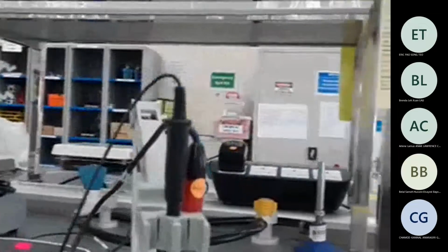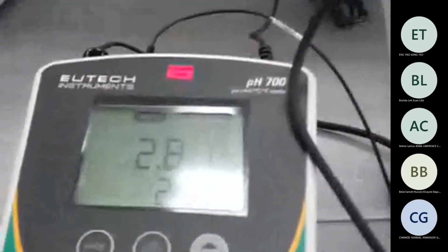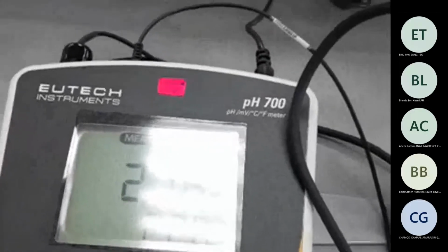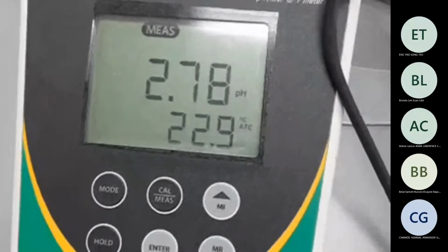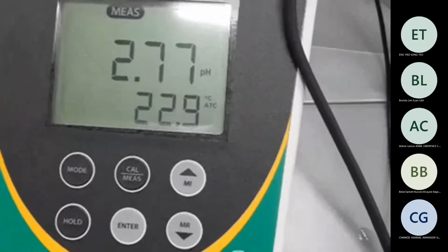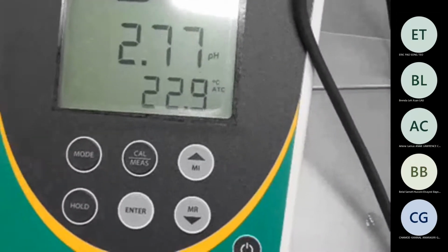We see that the pH instantly jumps up to 2.8, or it fluctuates a little bit, less or more, but there is a very big difference between these two.